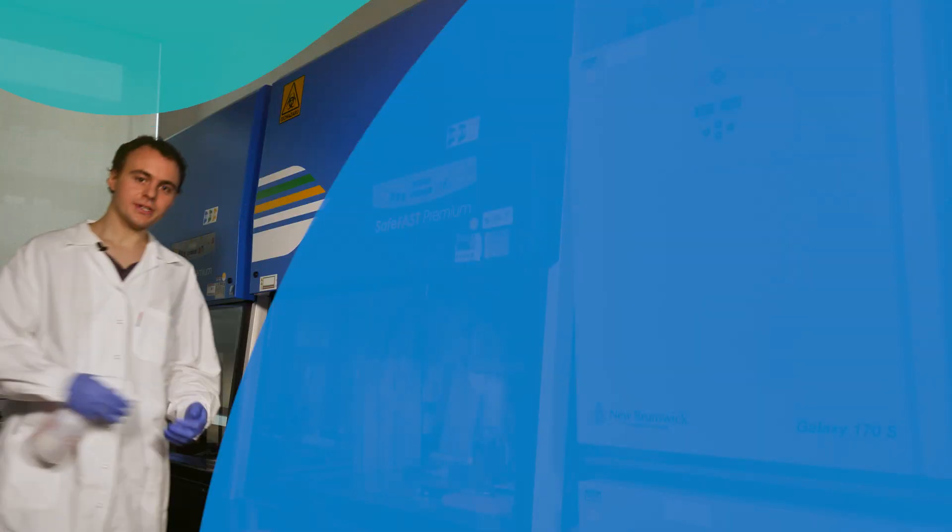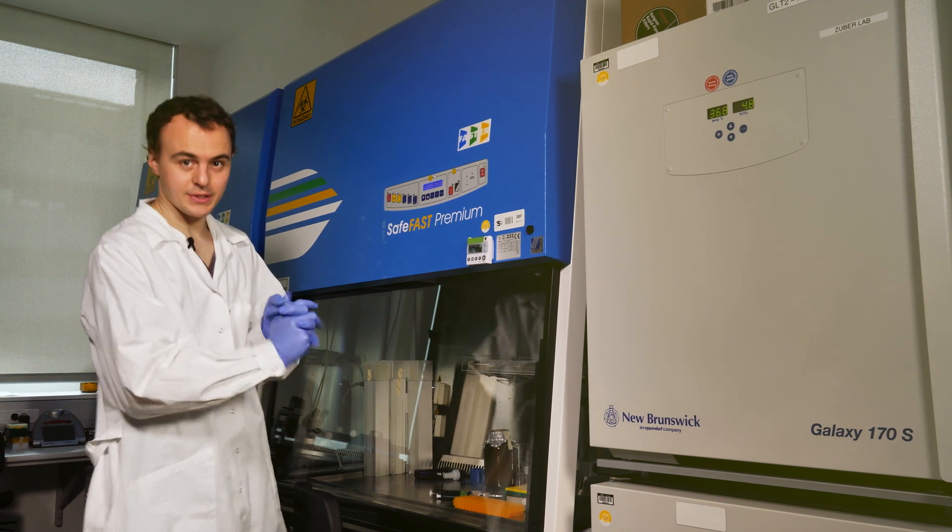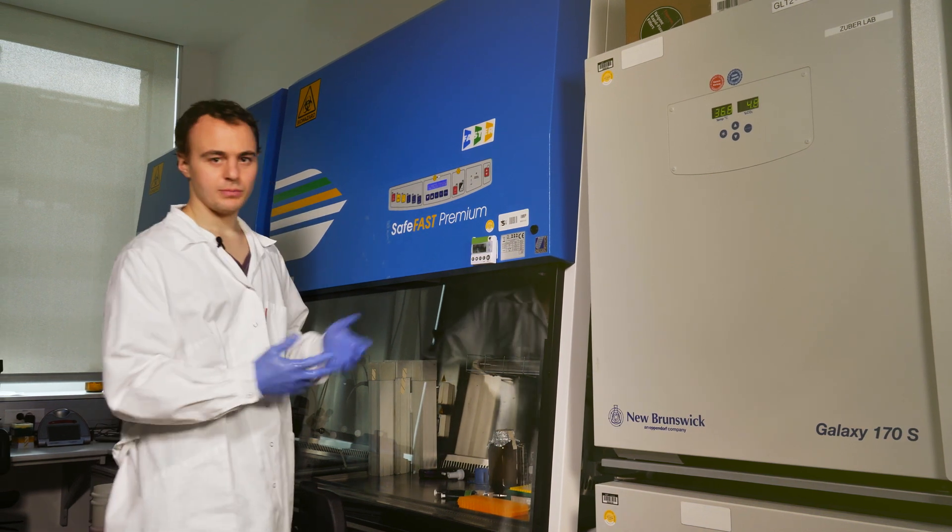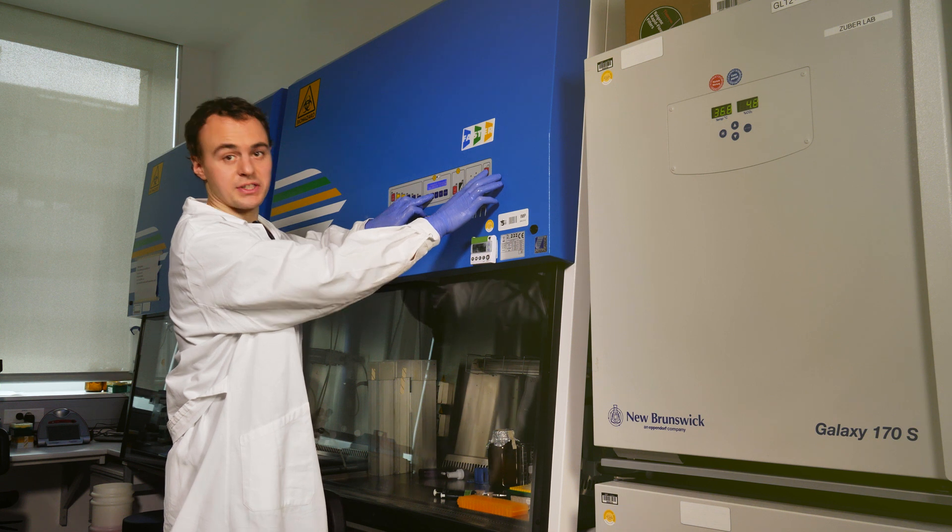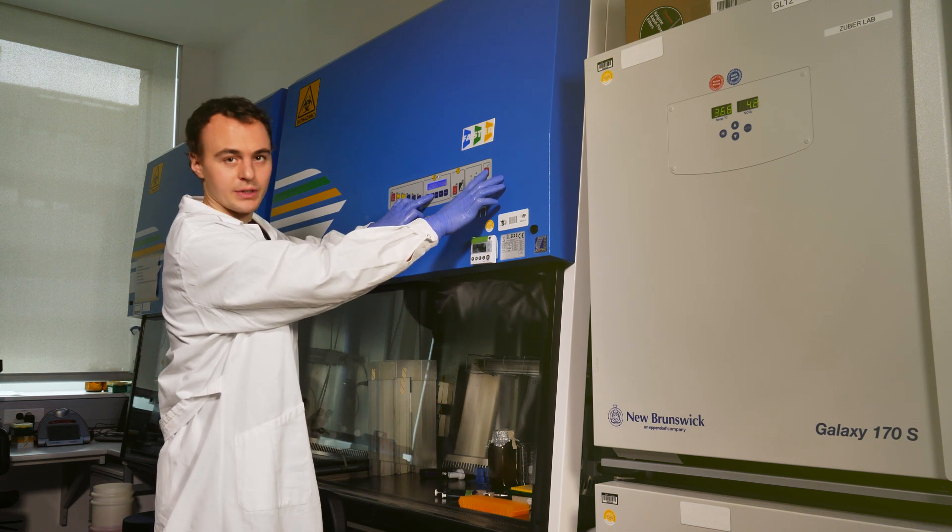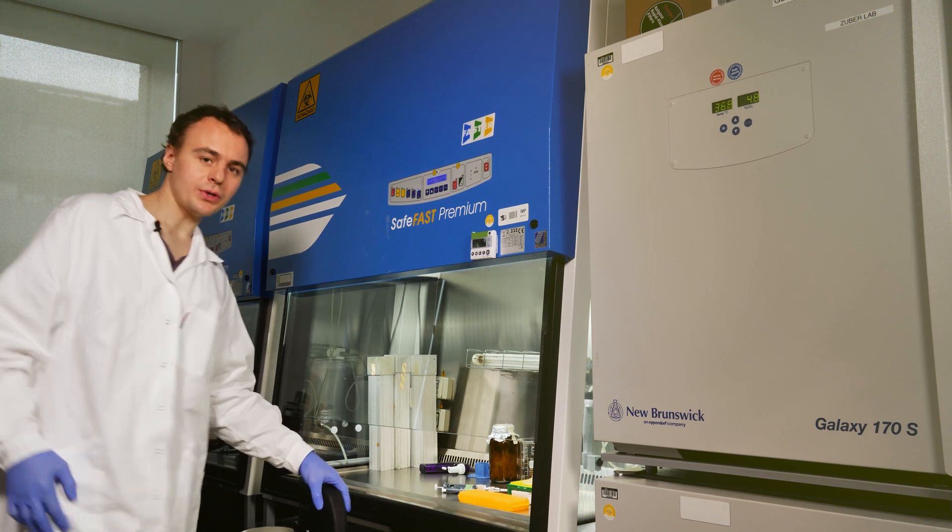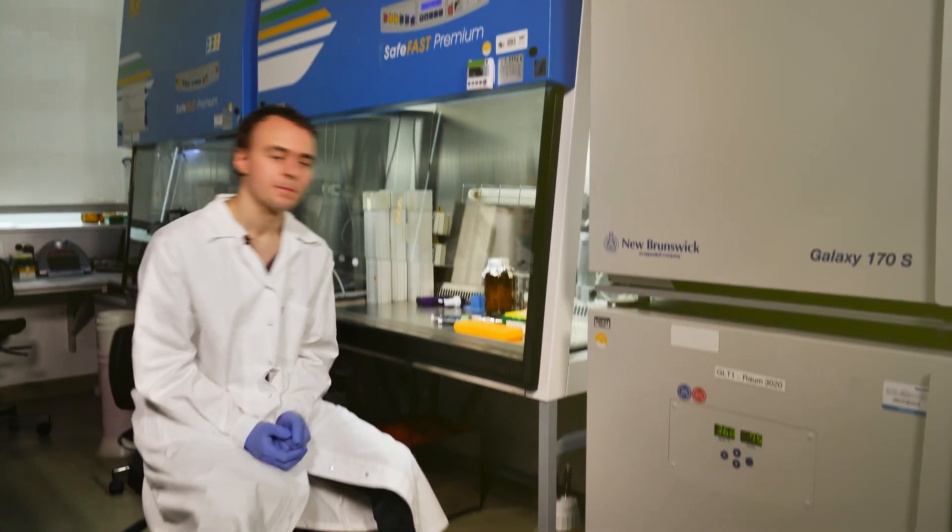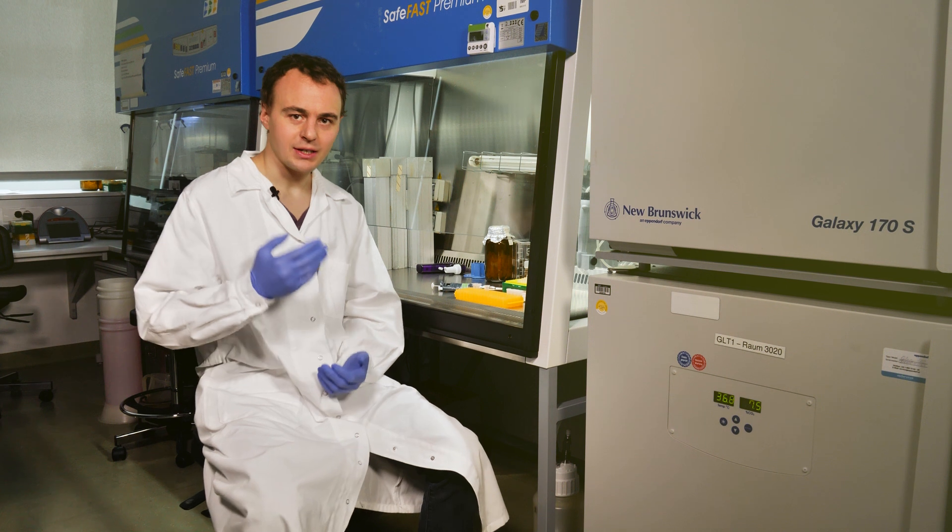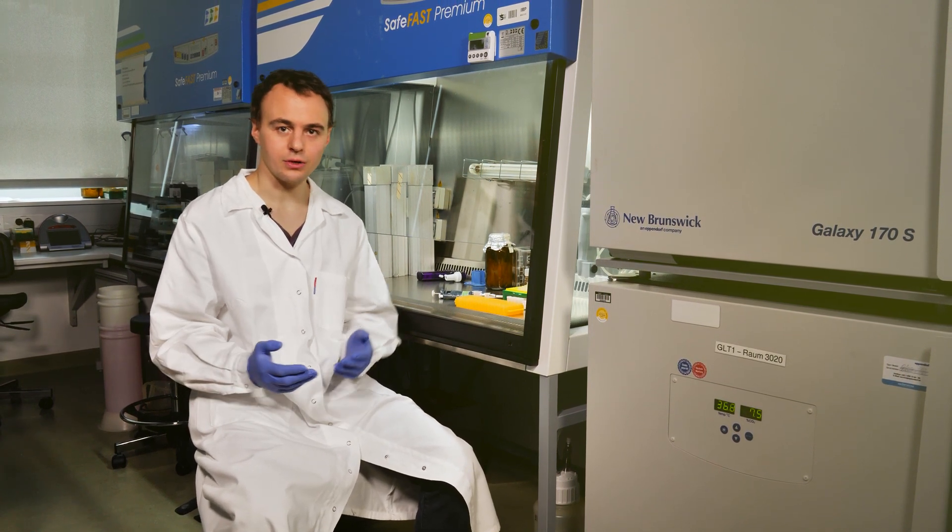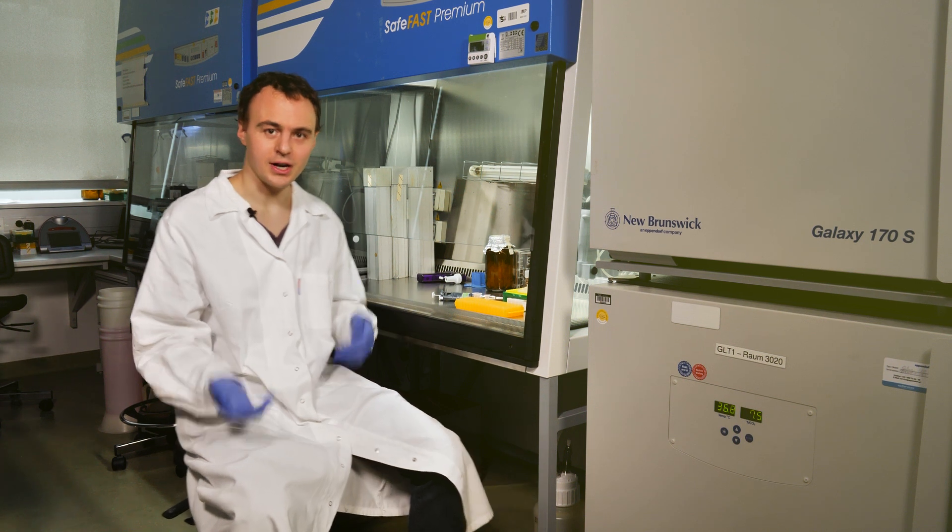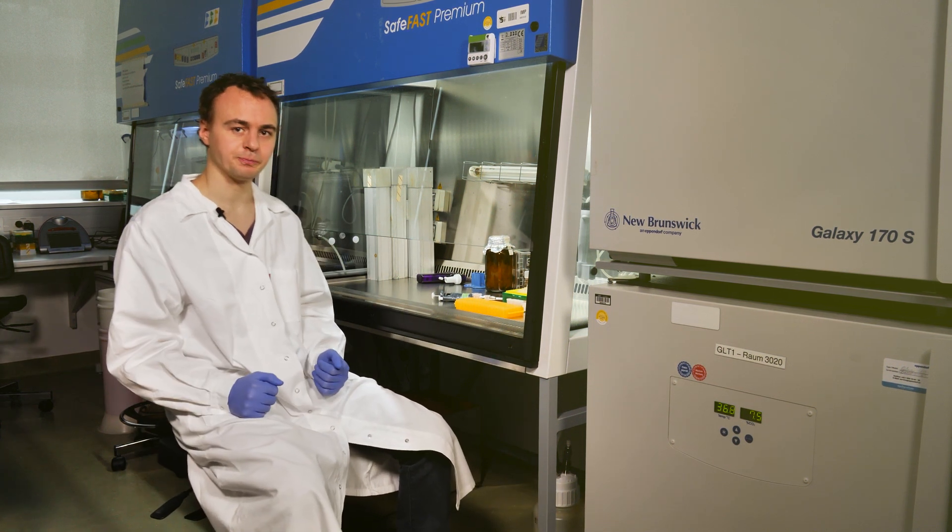We start off our experiment with perturbing our cells in cell culture. This can be basically anything like a drug treatment, cytokine stimulation, or even a chemical genetic technique. The one thing that is important is that it acts fast. You can imagine that classical genetic tools like RNA interference or knockouts that often take hours or days to work are not compatible with our fast SLAM-seq experiments.